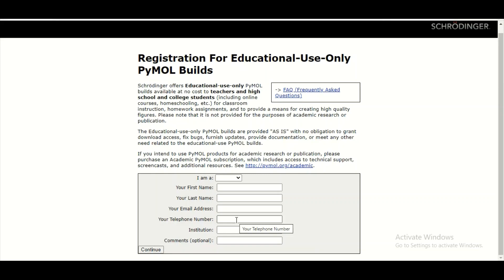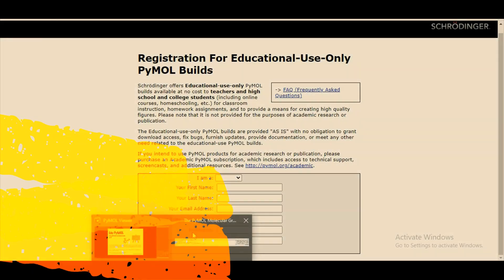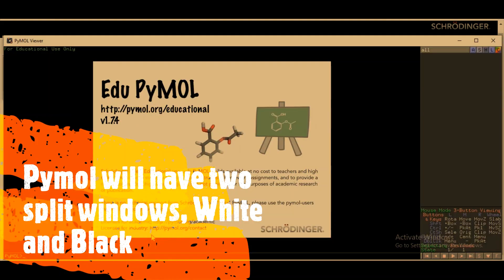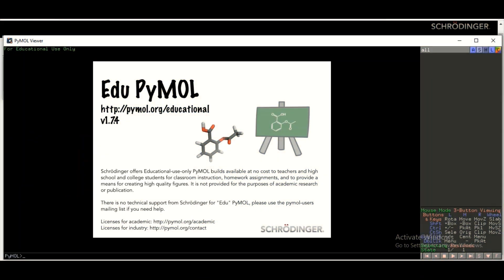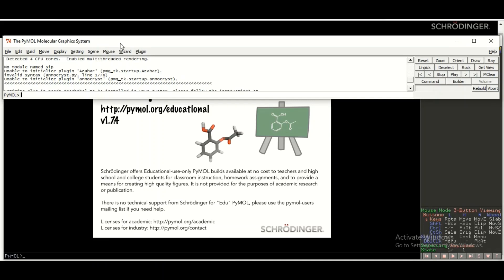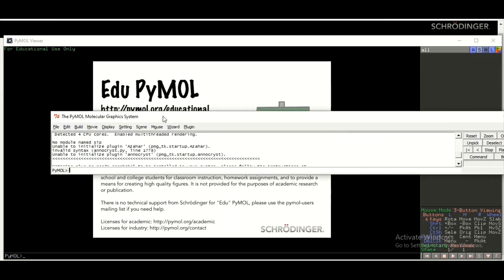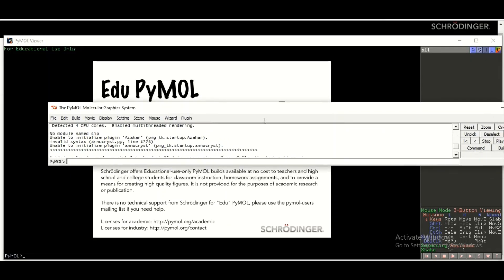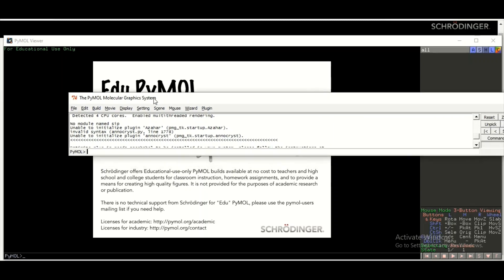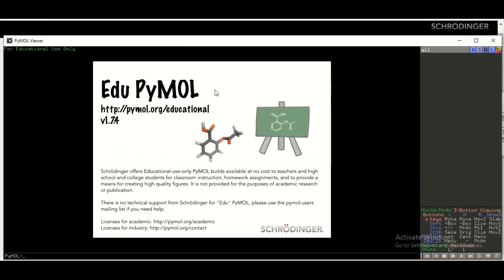Once you have PyMOL installed in your system and you launch it, you will see two windows. The white window is the control panel, while the black window is where you are going to visualize your three-dimensional structure of the protein.